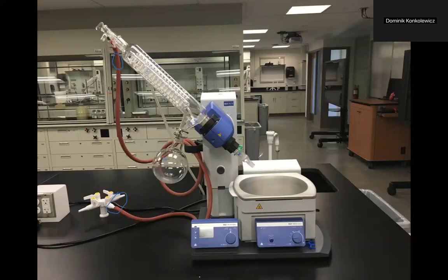We're going to put our flask right here, which will contain our caffeine in ethyl acetate. Key thing is don't fill the flask more than halfway because it tends to make a bit of a mess and spill up here. Then you'll put it in this water bath, warm it up a little bit, put the system under reduced pressure, and your volatile ethyl acetate will come up here.